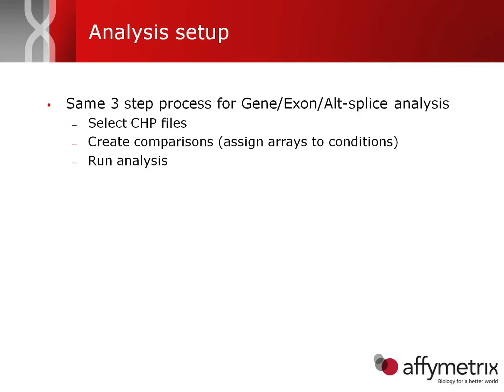The second is to create the comparisons, or in other words, to assign the arrays to the various conditions. And the third is to actually run the analysis itself.